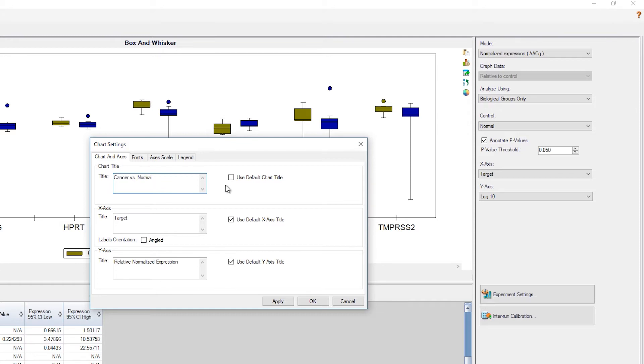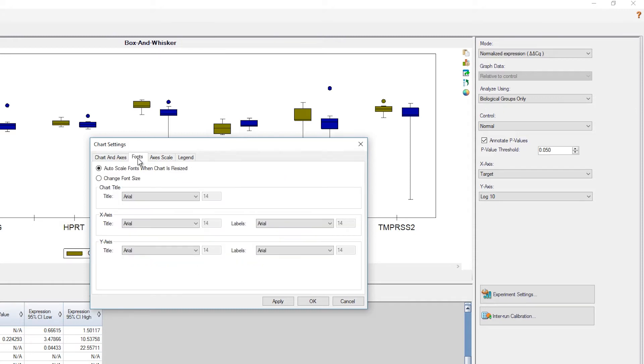Our axis are pre-labeled with default titles. Let's keep these. But a different font would be ideal, so we'll click on the fonts tab and then choose Times New Roman and increase the title font size.